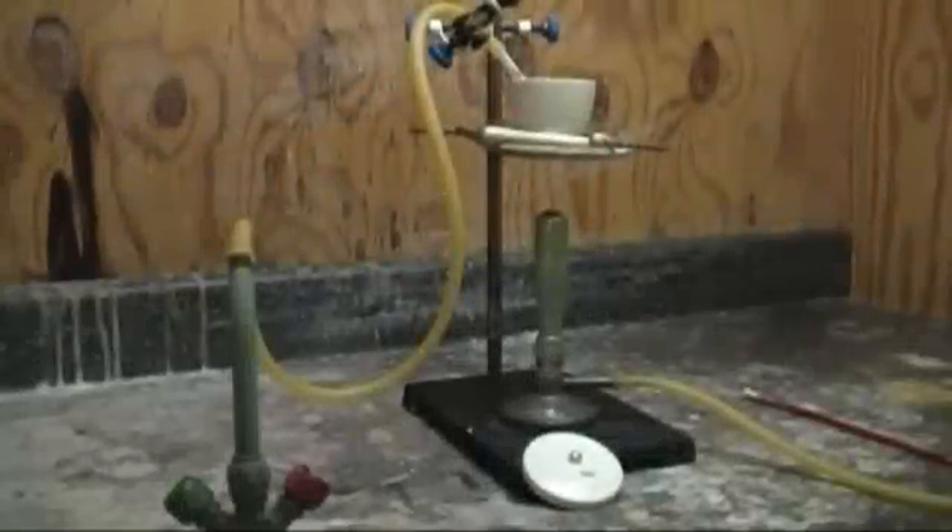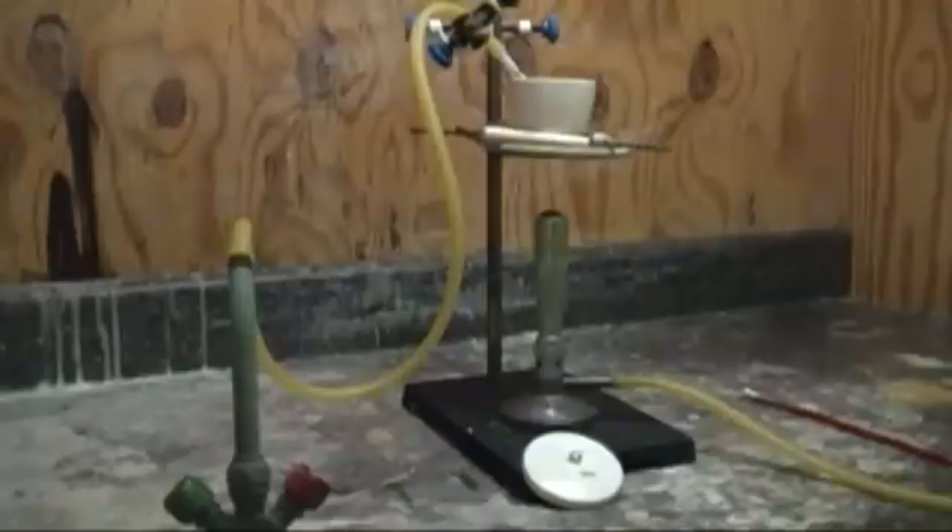My setup is very simple. I use a 100 milliliter crucible in a ring stand with a Bunsen burner to heat. My oxygen source is from my glass torch, which allows me to regulate the flow of O2 into the reaction vessel.